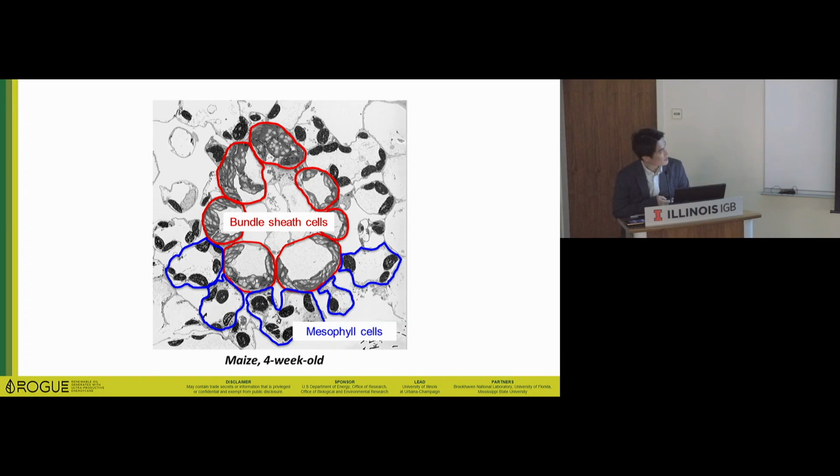Some slices catch some vacuole or nucleus or some other component in the anatomy, but sometimes it's very hard to trace or manually do the segmentation work. So in this case, I'm just focusing on the chloroplast and cell wall because I think Kingsley knows how much time he spent on the segmentation work. I don't want to spend an entire life on the computer. So this time I'm focusing on the cell, cell wall, and chloroplast, trying to publish it. That's my first goal.